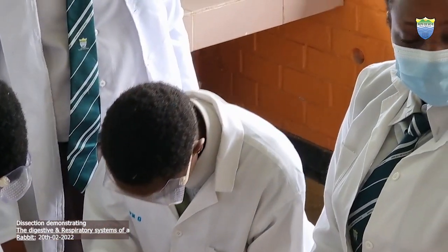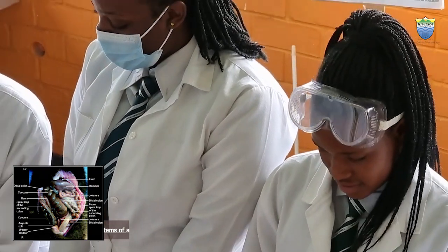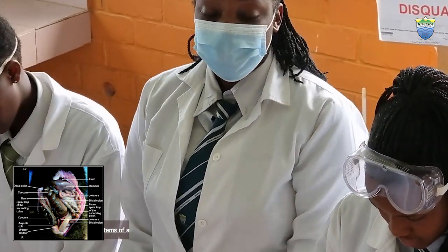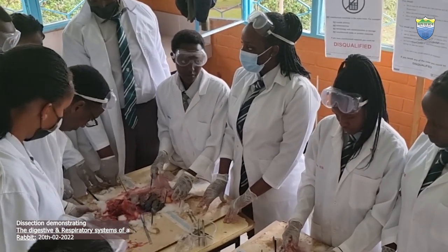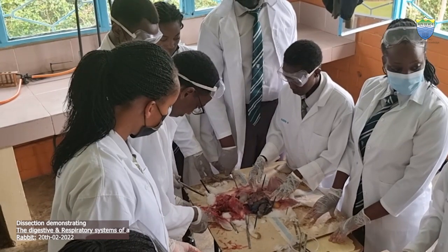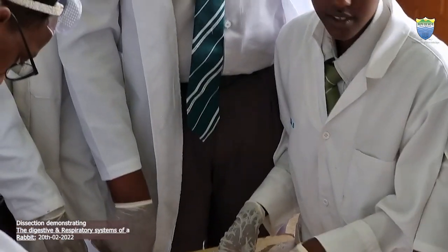And we also have some of the adaptations. When you look at these small intestines, you can see they have folds, which are for increasing the surface area. When the food goes into the bloodstream, it can be used by the cells. When it is excess, that's where the liver comes into play, whereby it is going to store the excess glucose in form of glycogen.